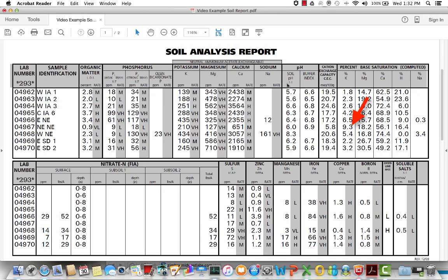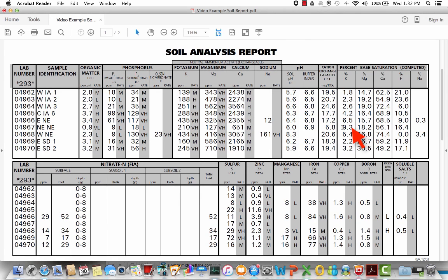So as we look at this lighter CEC sample here, with a 5.8 CEC, its base saturation is quite high at 9%. Its part per million is high, and it's higher than that 200 part per million that we said we were kind of shooting for in the average soil. And again, because this soil's lighter, we might want to shoot for a little bit lower part per million, maybe more that 160 to 170, but again, depending on that grower's yield goals. But this higher number gives me plenty of potassium from a base saturation standpoint. The sample here from western Nebraska, again, a pretty good amount of potassium as far as base saturation is concerned at 5.4%.